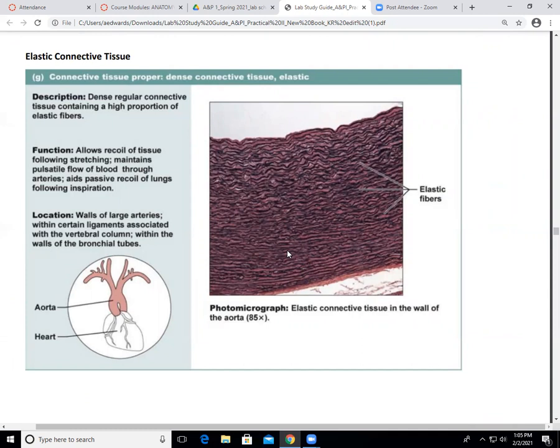So we also have, in connective tissue proper, elastic tissue. Okay, so this one also has some fibers that stain dark. These are elastic fibers, so gives the tissue more flexibility. Now, I told you earlier, reticular fibers have the black lines, and they do, but they're kind of all different directions. These are all kind of, again, flowing in that wavy pattern. Okay, so this is elastic tissue.